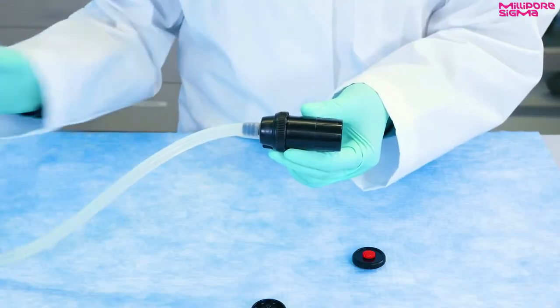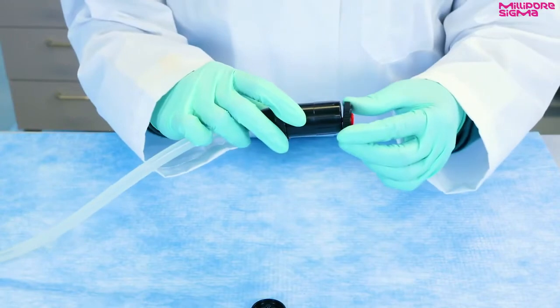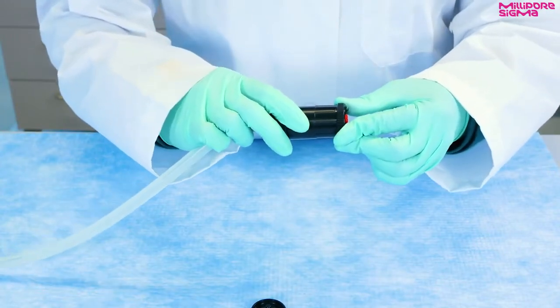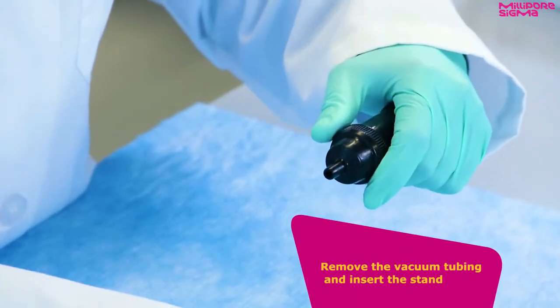Once the sampling is complete, turn off the pump and replace the inlet cover to protect the filter. Remove the vacuum tubing and insert the stand. Label the monitors and send to your lab for analysis.